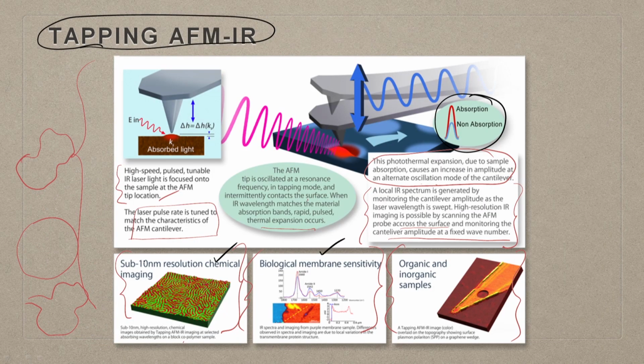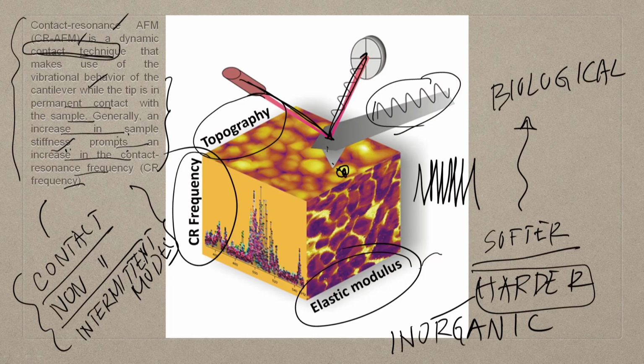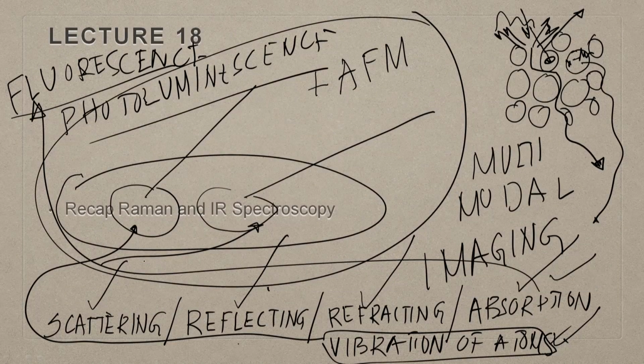We talked about tapping AFM-IR mode, which is an even more powerful tool. Then we went on to talk about contact resonance AFM.